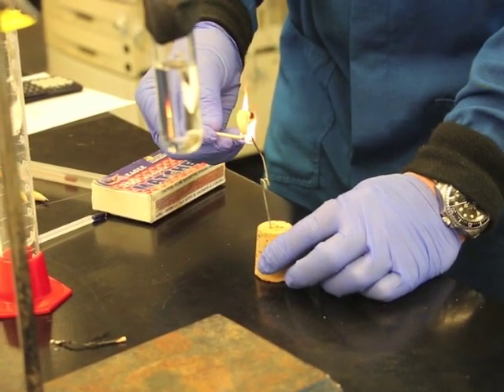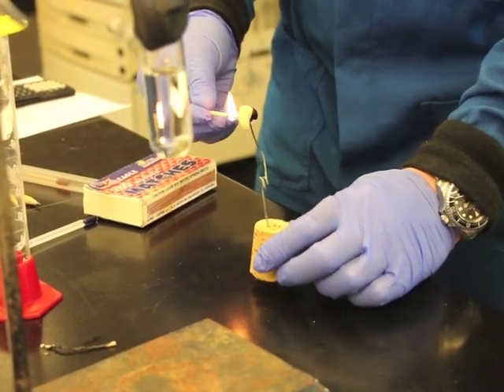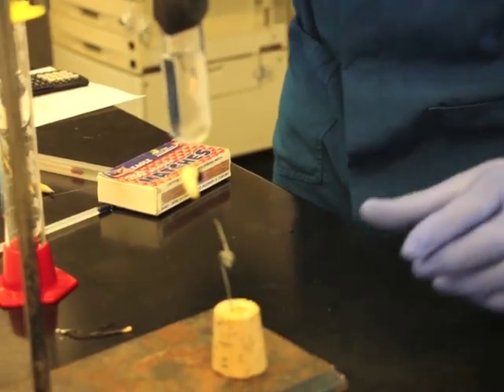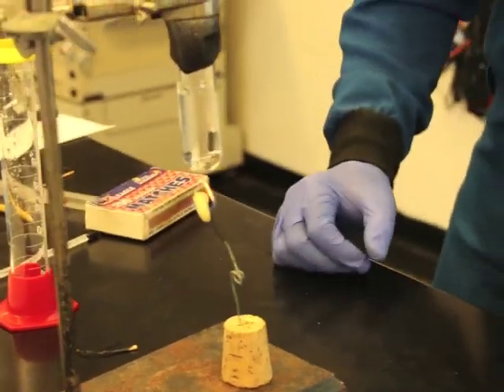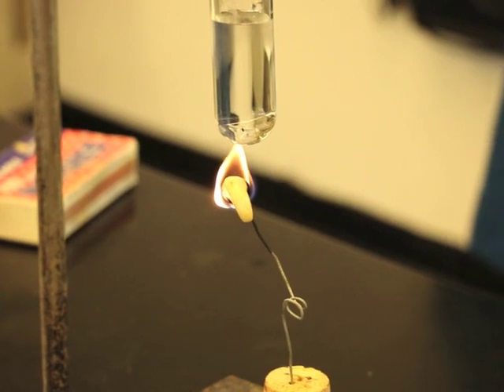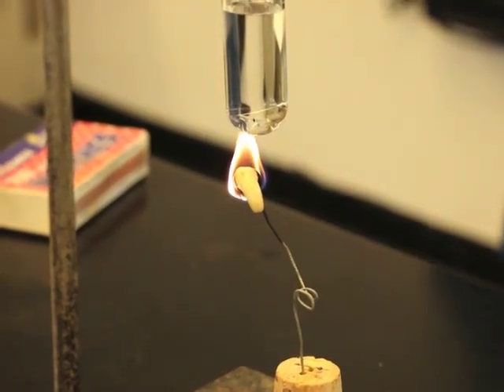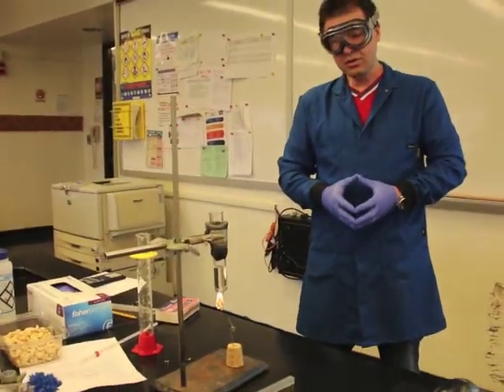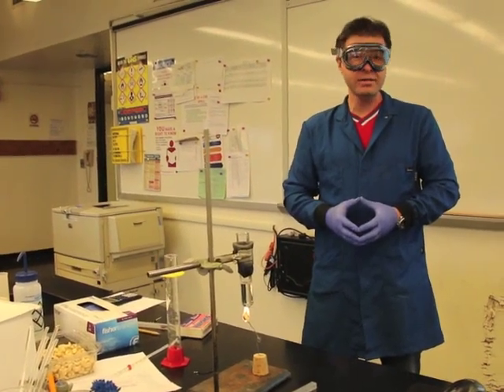I'm going to start burning this cashew now. Just be patient, it's going to take me a little time here to get it going, but I got it going now. I'm going to put it right at the bottom of this test tube so the energy released by this cashew will be entering the 20 ml of water. Let's wait until the entire cashew burns.